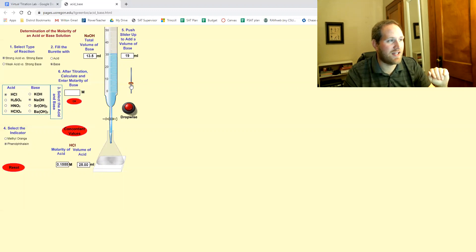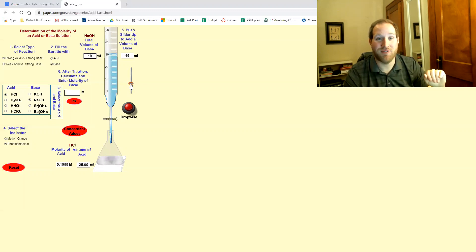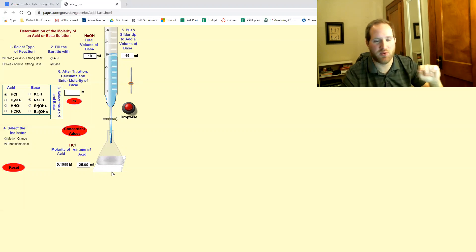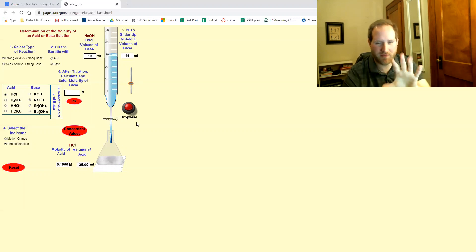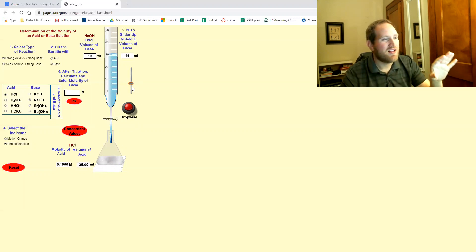This is not the way you want to do it. I'm gonna add like five. Ooh, I actually got really lucky. I happened to hit it right where we would want to stop anyway. But let me just demonstrate.